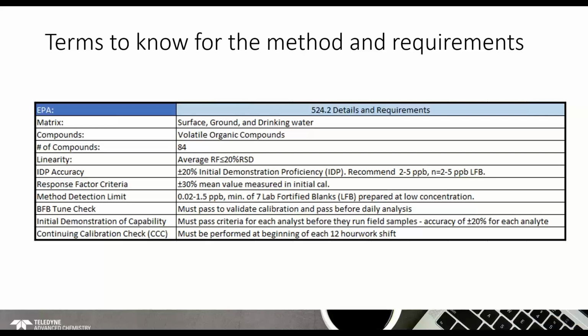Per each method is a detailed platform of the method QC requirements that has to be followed to assure and justify the integrity of the instrument and sample analysis. This table demonstrates the core requirements of EPA method 524.2 and is here for your review. The main difference I wanted to point out here that you will notice in the comparison of 524.3 and 524.4 is the MDL being replaced with the MRL, or minimum reporting level, to calculate the upper and lower prediction interval of results.